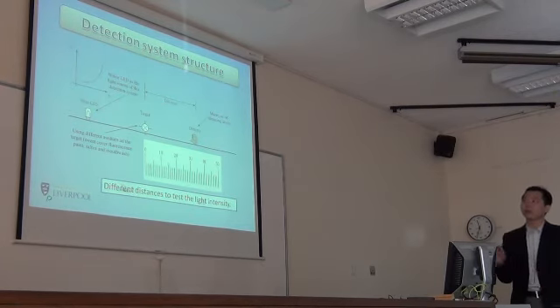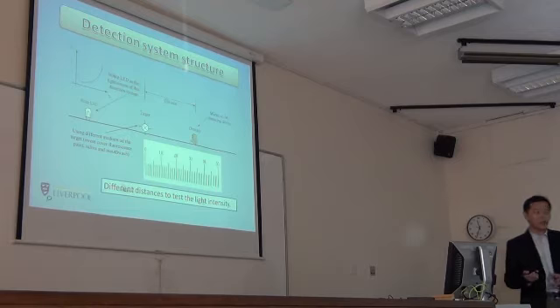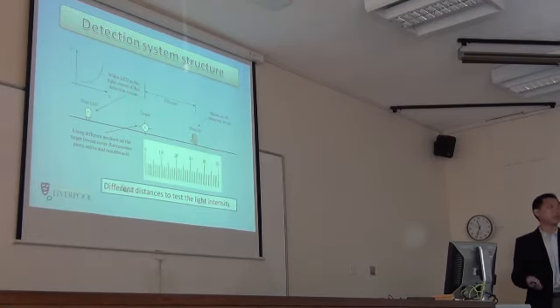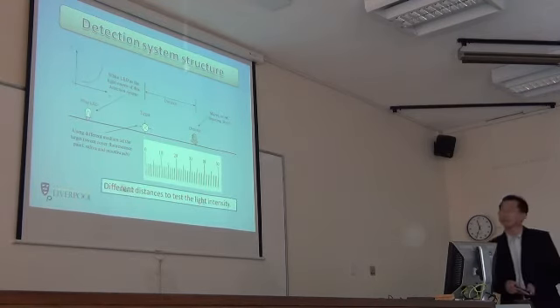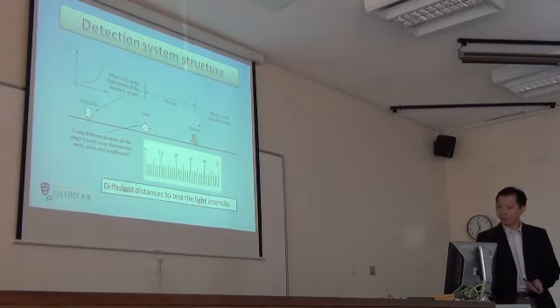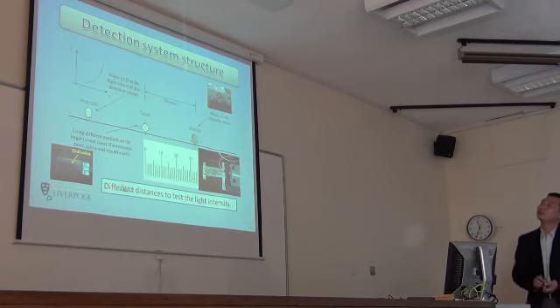When I use the white LED to light it, I hope that if the target is bacteria, I can successfully induce fluorescence from the bacteria, then use the detector to monitor it. So here I'll show you some physical images.